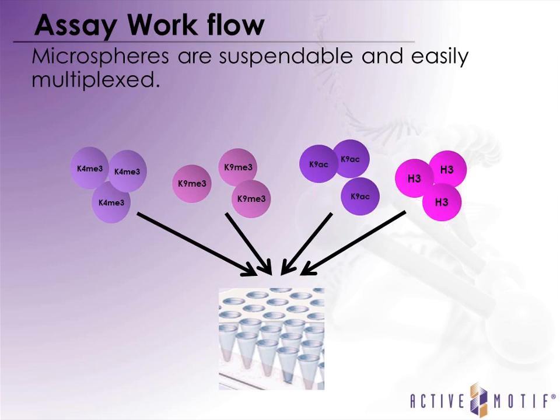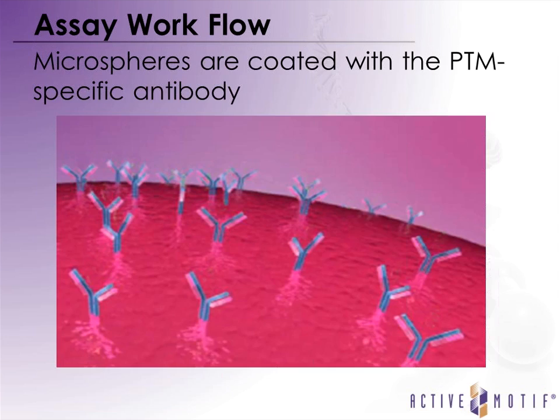To give you an idea of what is involved with regards to hands-on manipulations to perform an assay, you start by creating a master mix of the beads that corresponds to the marks of interest. And you dispense the beads into the wells of an assay plate. Each bead is coated with a distinct modification state-specific antibody whose specificity in the context of this assay has been extensively validated during development. I won't touch on the nature of that testing now, but if anybody has any questions at the end of the seminar, I'd be happy to elaborate on that further during the Q&A.